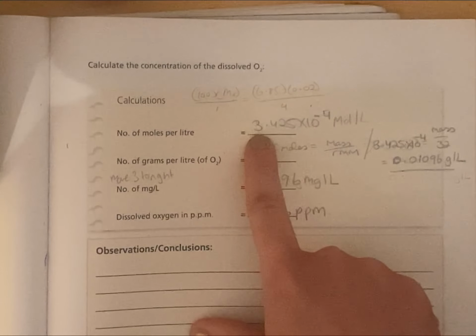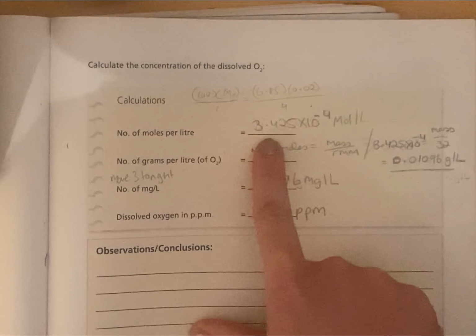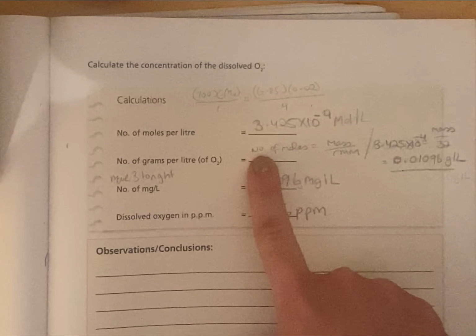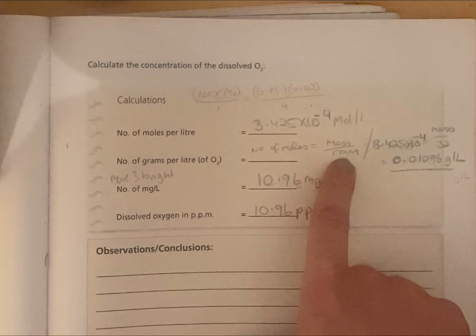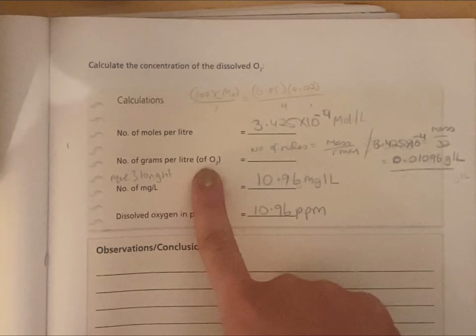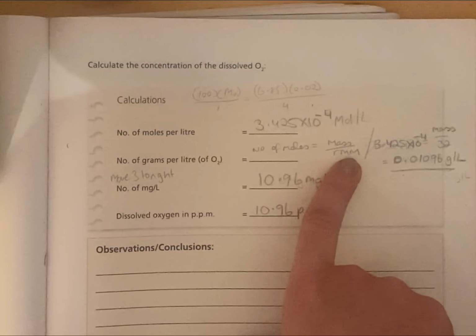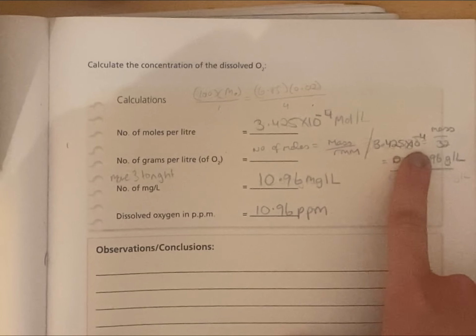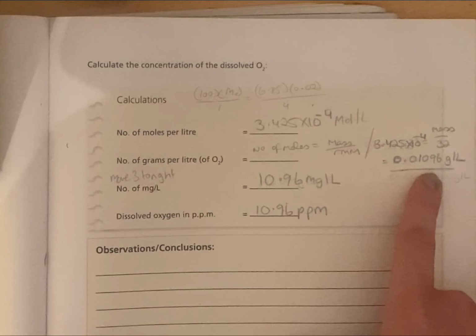I got 3.425 times 10 to the minus 4 moles per litre. To convert that moles per litre into grams per litre, use the normal formula: number of moles equals mass over relative molecular mass. Remember, oxygen is O2, so it's 2 times 16 for the relative molecular mass, which is 32. So take your number of moles and multiply it by 32, and you get the mass in grams per litre.